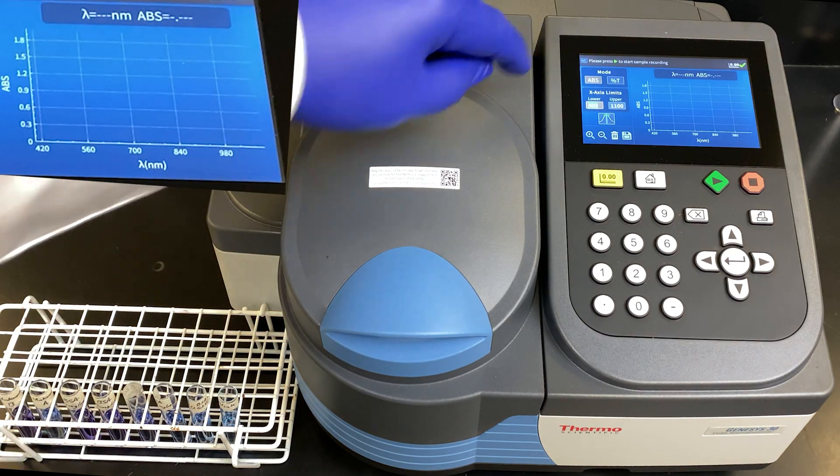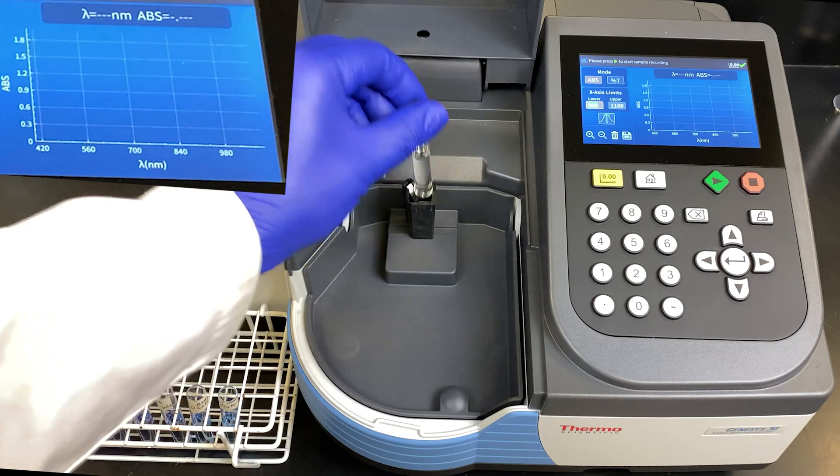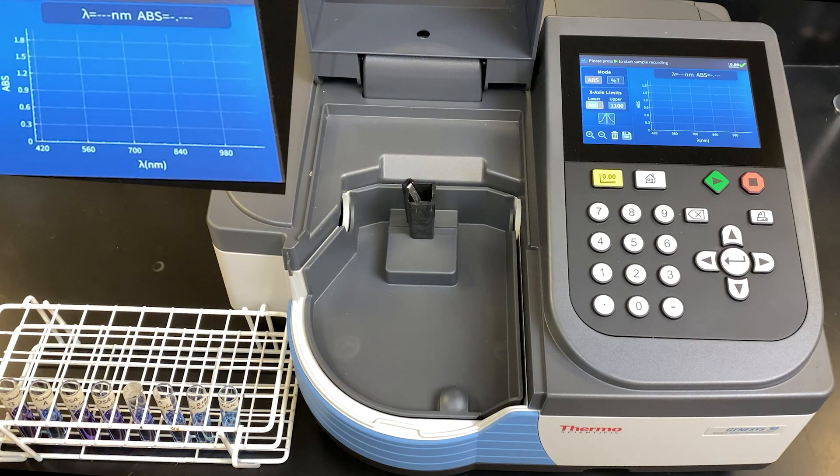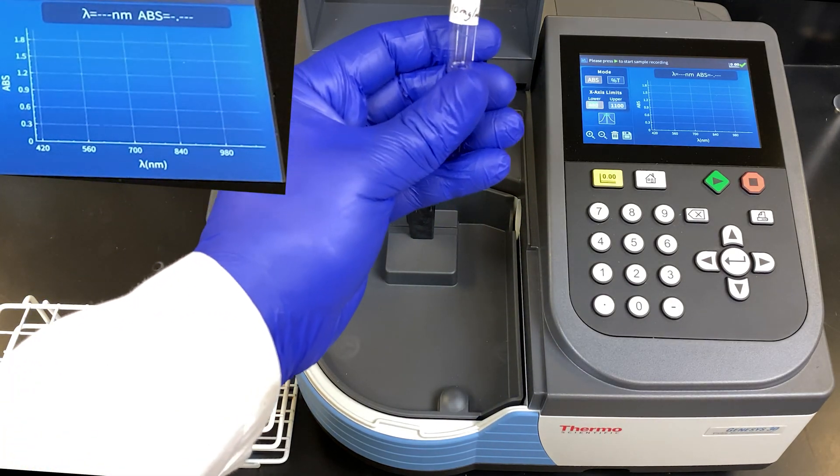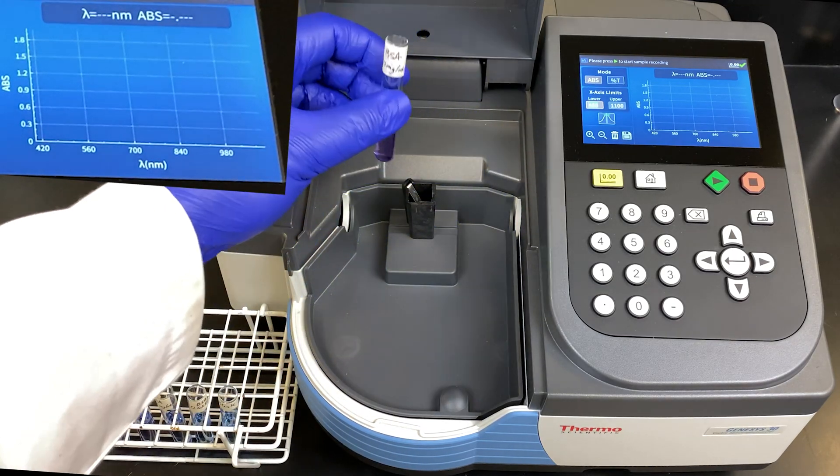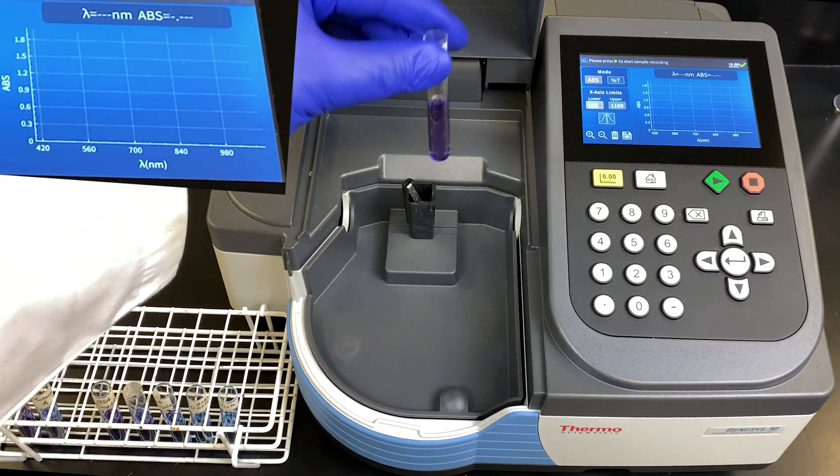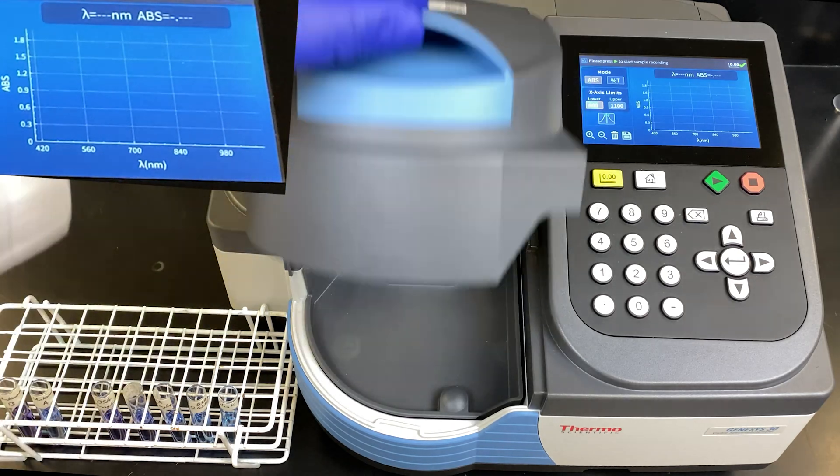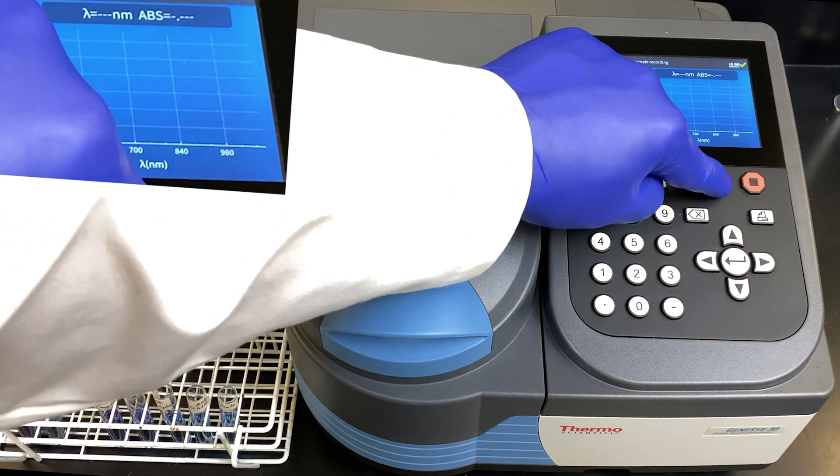Almost done. It now says present your sample. We will remove the water. We will take the highest concentration BSA, 10 milligrams per mL, place that into the cuvette holder. And press the play button right here.